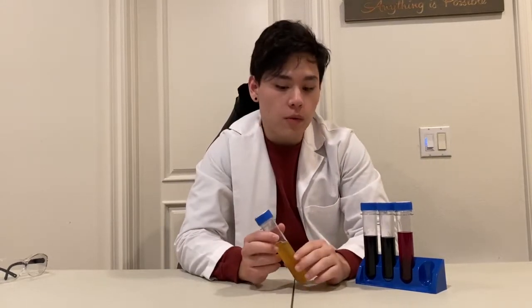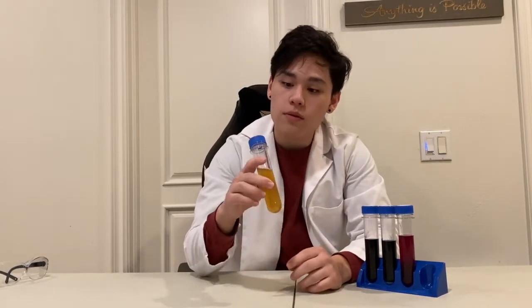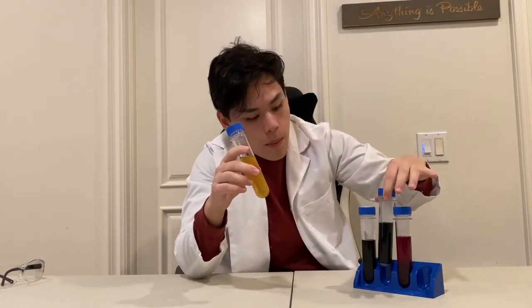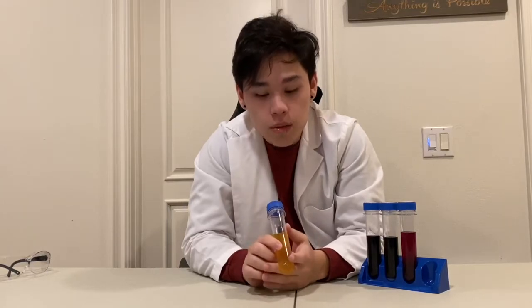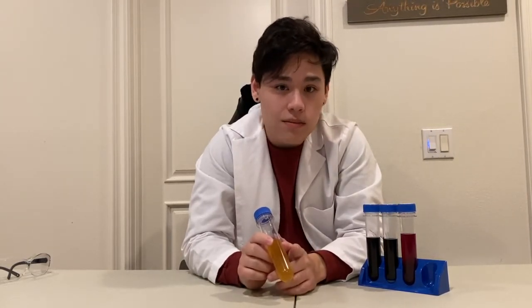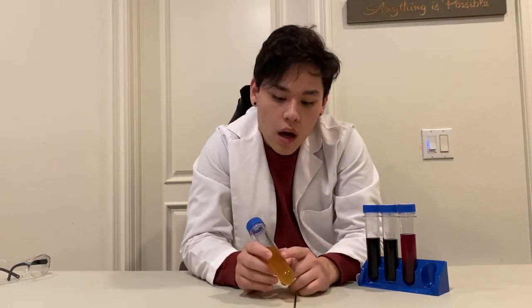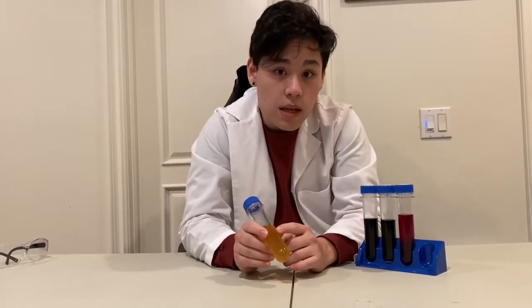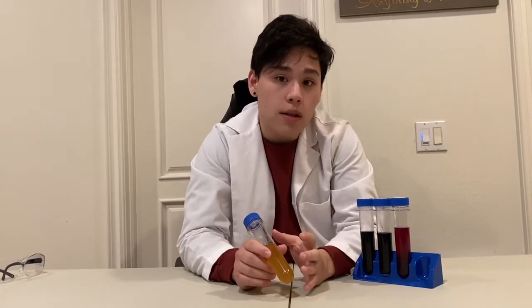This was a really cool experiment. We got to see how anthocyanin was able to change colors based on whether an acid or base was added. Taking the 6% bleach solution as an example — I didn't expect it to turn yellow; I expected it to turn more like a deep green similar to the sodium bicarbonate solution. But the more I read up on it, the more I realize that the more basic a solution you place anthocyanin in, the more yellow it gets. I think bleach brought the pH to at least 11 or 12, so a lot of the anthocyanin was able to form more extended conjugated pi bonds, with the base pulling the hydrogen off both oxygens, making even more pi bonds available for lower energy transitions.